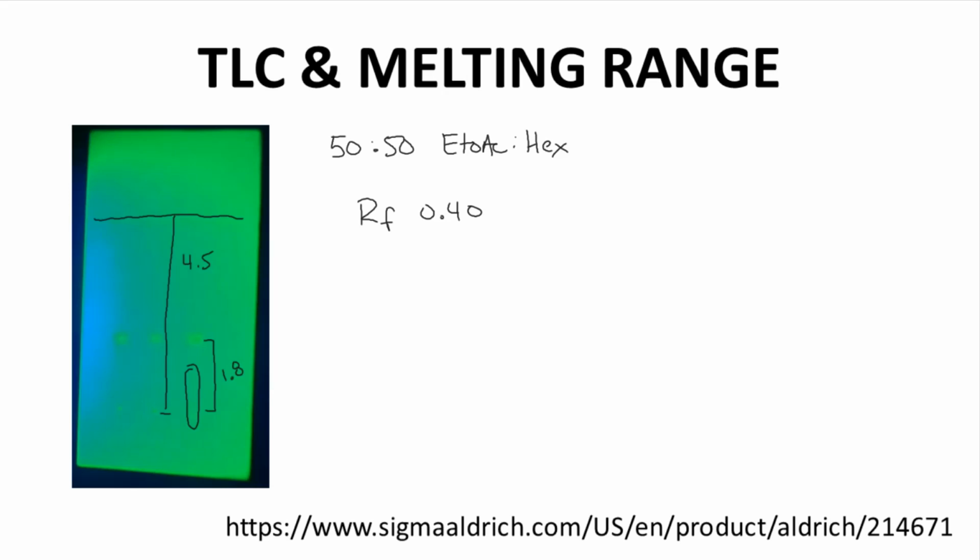Well, the product melted over a range of 115.5 to 118.6 degrees Celsius. The literature value is 119 to 122 degrees Celsius. I pulled this melting range from this compound's Sigma Aldrich page.